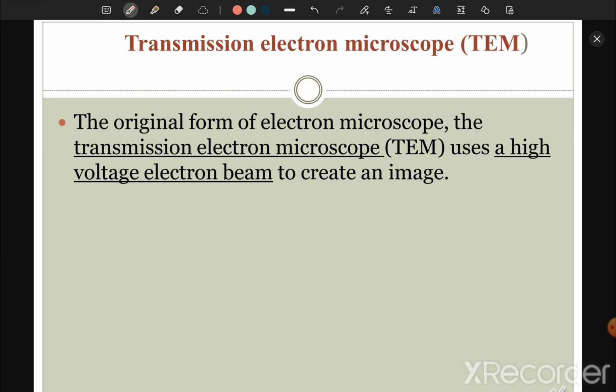It's not just a matter of magnification and resolution. The colors are different. The colors in the electron microscope are usually white and dark, but still you can see the ultrastructures. While in the light microscope, it is the usual H&E staining that is used in the basic routine staining of the glass tissue sections.